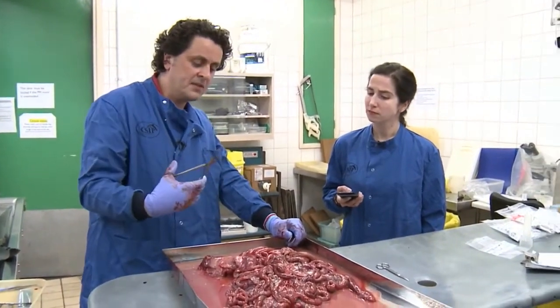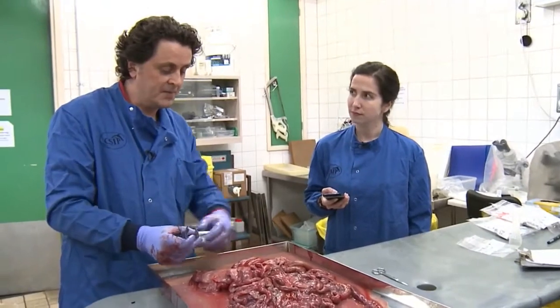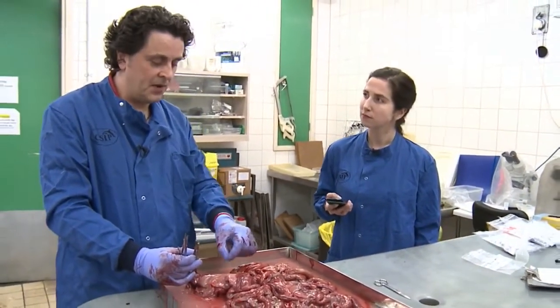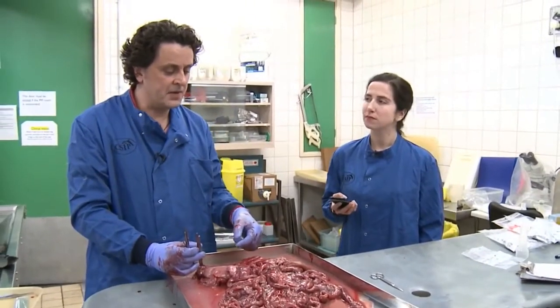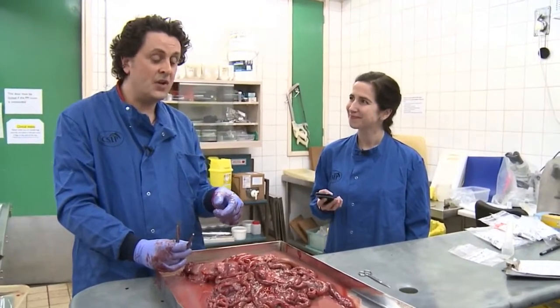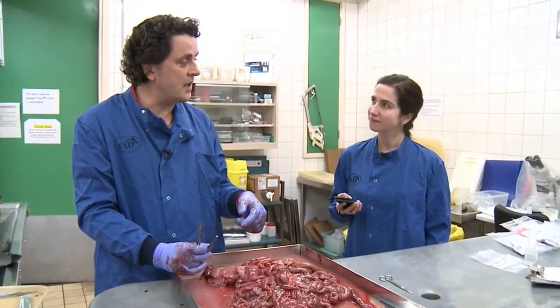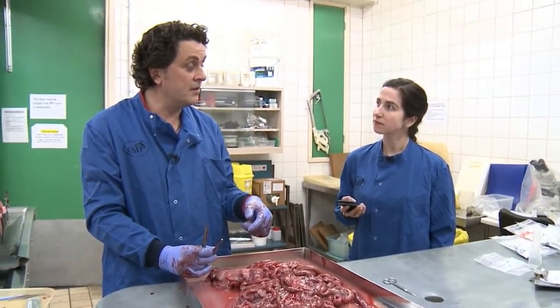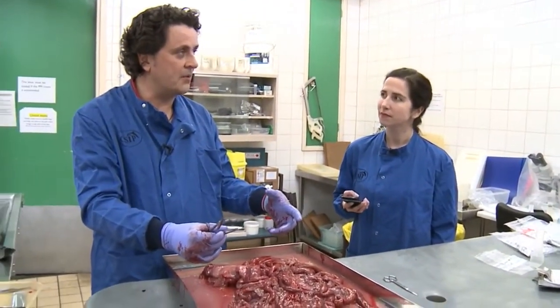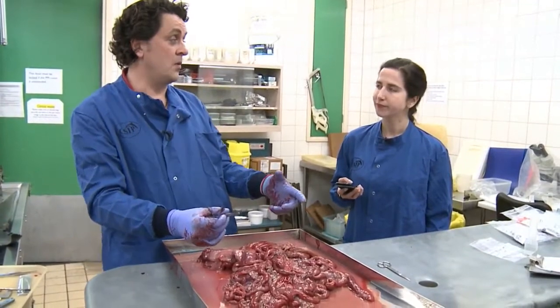But I think from our perspective, we think that's probably the case because we see bones in the first stomach, less in the second, few in the third, and then very rarely in the intestinal tract. And for those that have been with us throughout this CSI the Sea journey, you might remember the first animal we examined a year and a half ago. That had bones packing out that first stomach, so that was something pathological. There was something wrong with it.